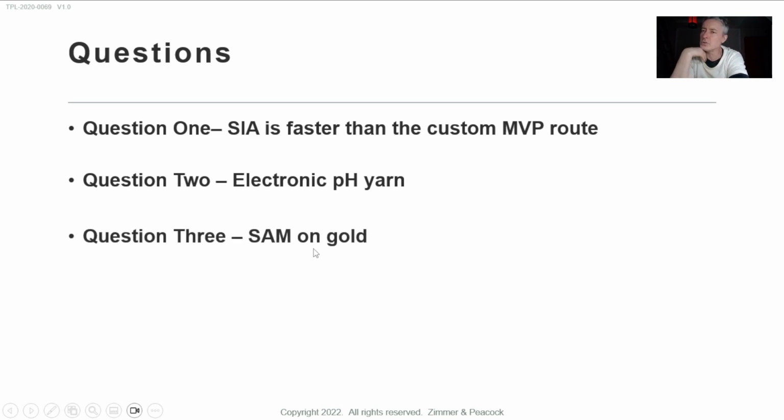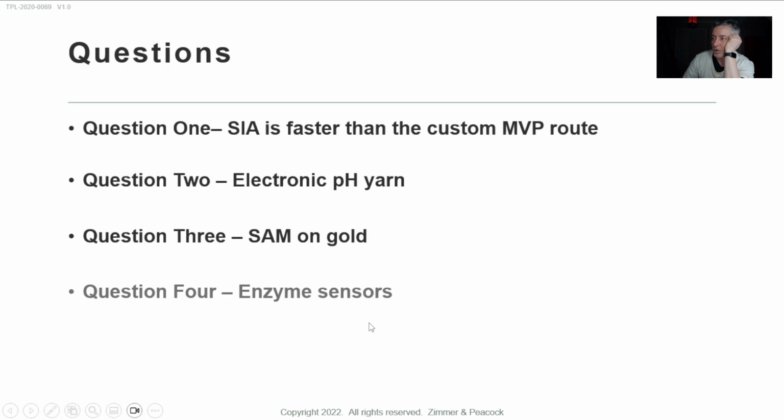Self-assembled monolayers on gold. Make sure you reduce that thiol. Make sure that you activate the gold just before the formation of the self-assembled monolayer. Make sure you use spacing molecules. Go for a simple approach, and then you can couple with EDC NHS. Just use a simple assay, like a blocking assay. And ZP has discussed that quite a lot on our website.